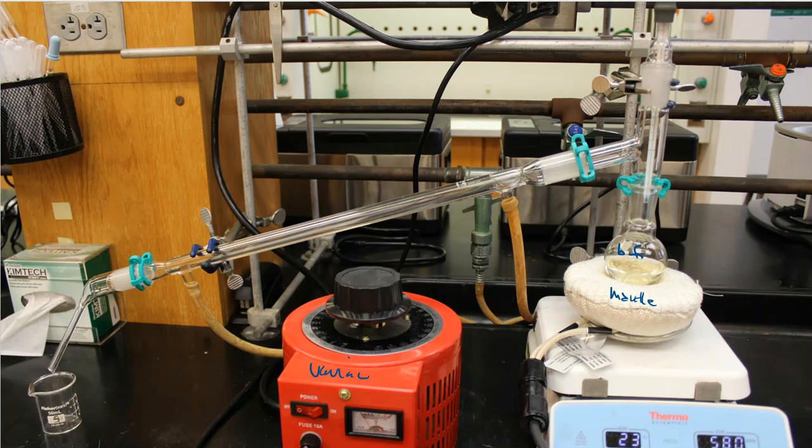And the reason that I have the hot plate down below is for the stirring feature. So this is going to evaporate, and it's going to go up through what we call the side arm. That's what this piece is called, and the reason is because on the side, it has an arm. Look at that. Well, go figure. No one said organic or these types of laboratory setups were rocket science, did we? No, absolutely not. We're in chemistry. It's much easier. All right, so here is the side arm.